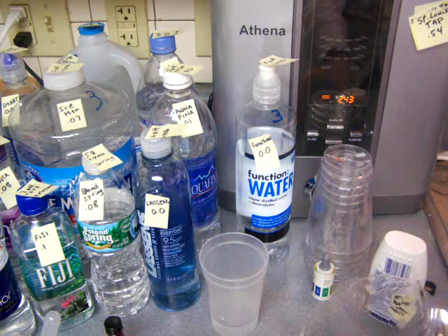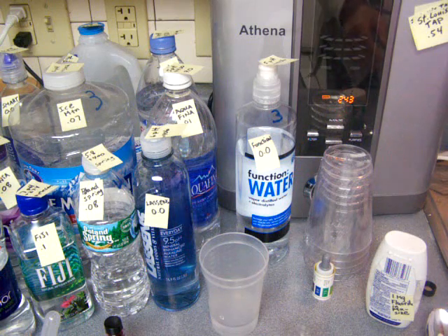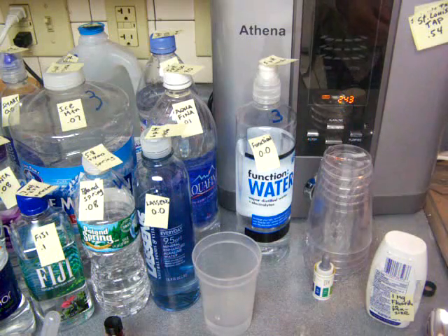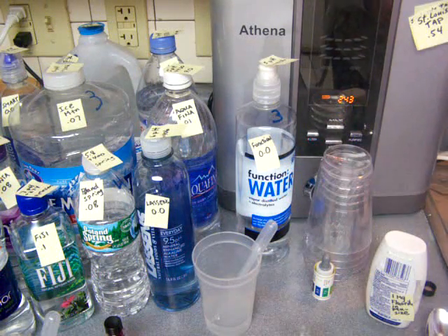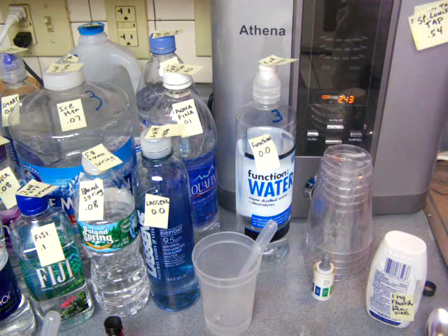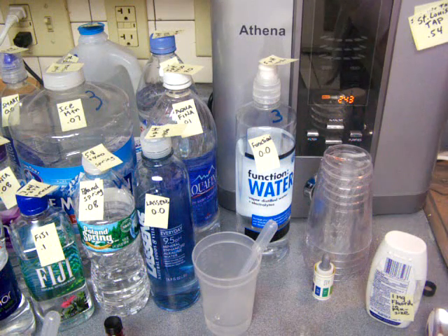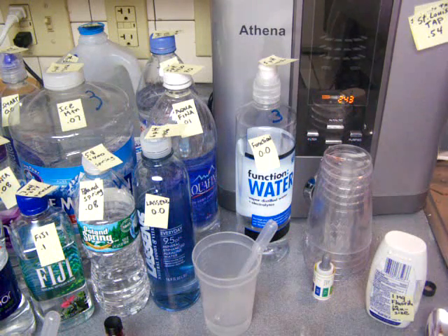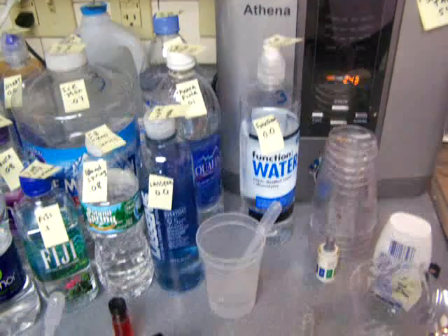I'm going to get a sample of St. Louis tap water to start with, and just compare that with the other bottled water. St. Louis tap water, by the way — St. Louis adds fluoride to the tap water, so it's going to be pretty high in fluoride.